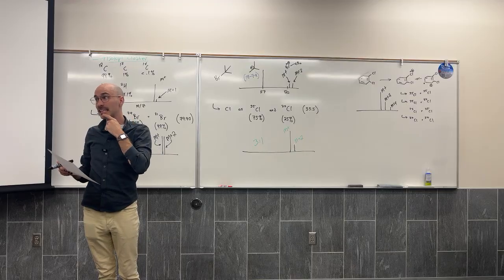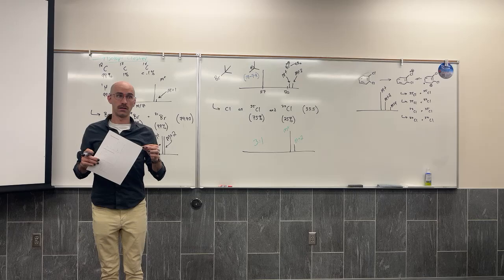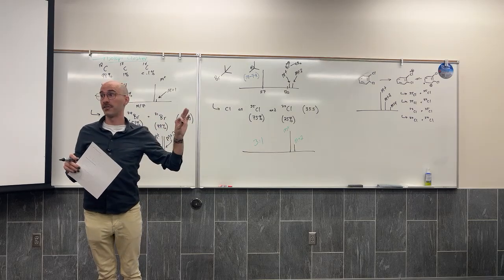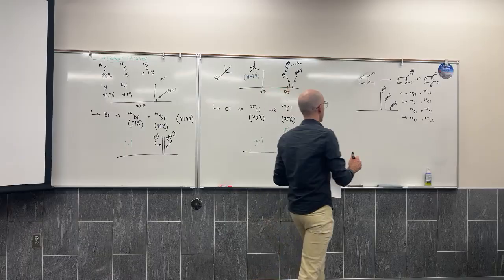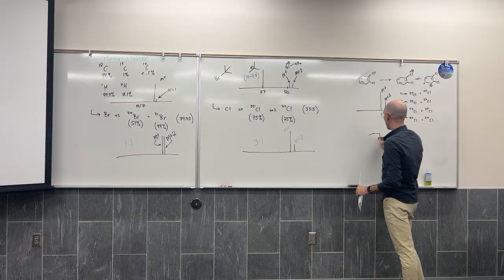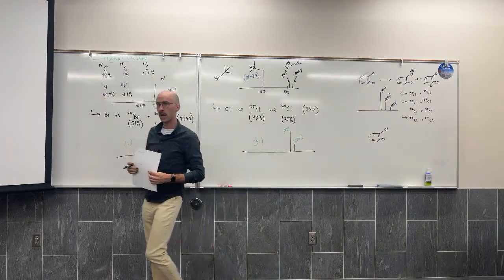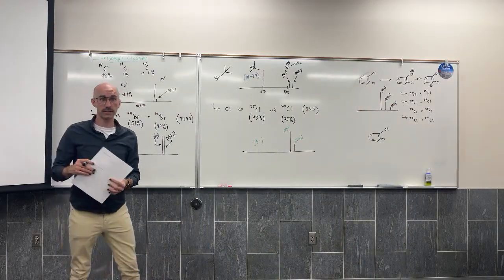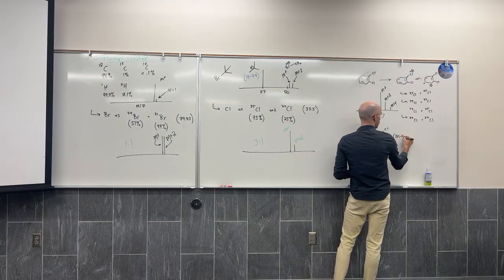Now, it's likely that one of the chlorines could get cleaved off. And then we form a cation daughter ion where one of the chlorines has been lost. So another major peak comes from the loss of one of the chlorines, which we would label as M minus 35.